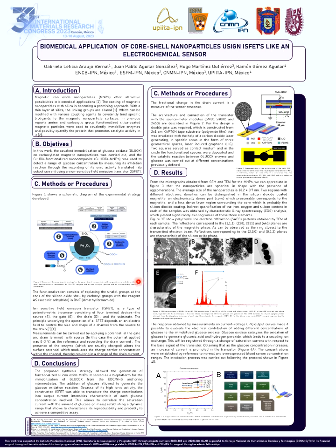In the figure named with the letter E, we can observe the electron diffraction patterns that were obtained, and we can check the lattice parameters, which we use to identify reflections corresponding to magnetic phases and characteristic silicon oxide phases.